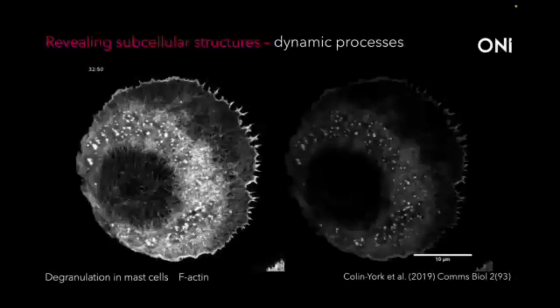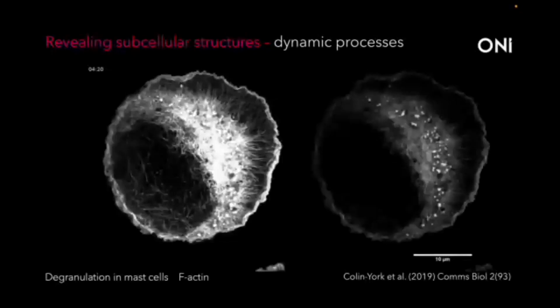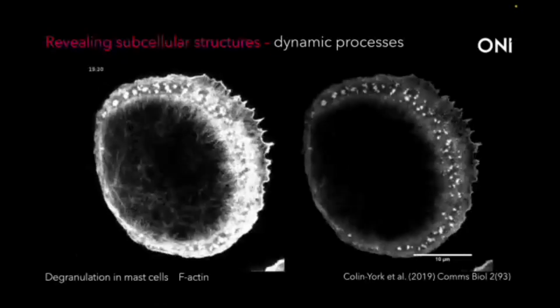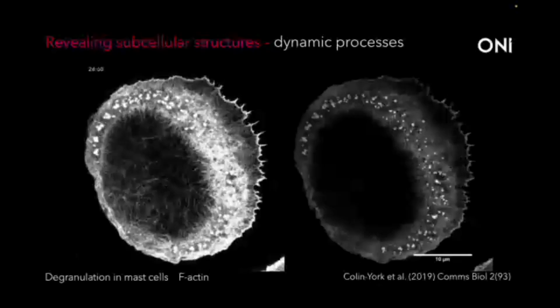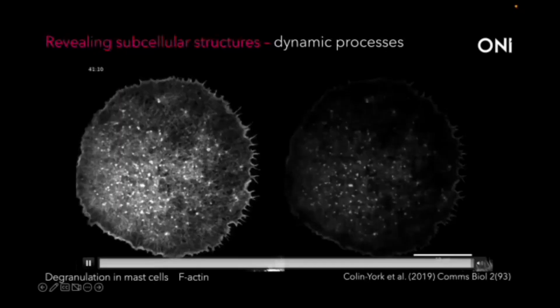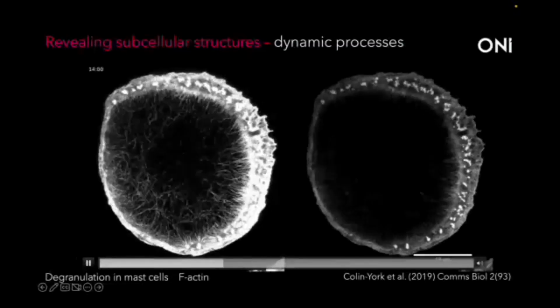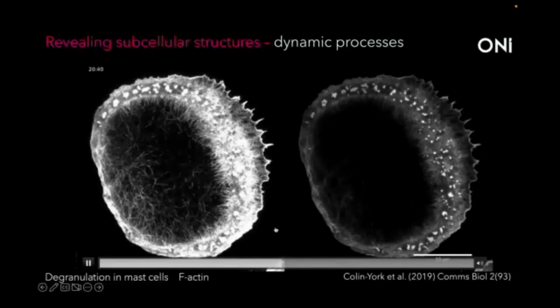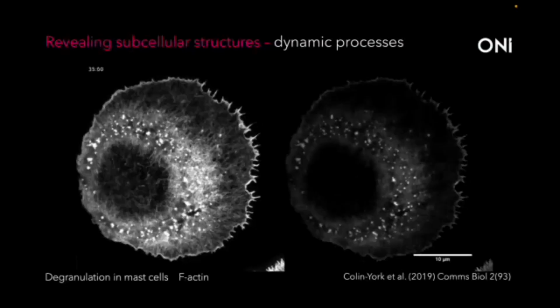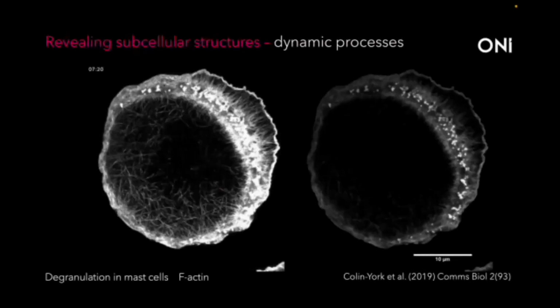This is actually in seconds, not minutes. So, you see again here, the very dense actin network restructures. And not only does it move out of the center, but you can see at the periphery you get these new structures forming, which are very dense. They have a very different actin organization to the center. So there are multiple different actin species that occur here, and they're only really possible to see through super resolution microscopy.